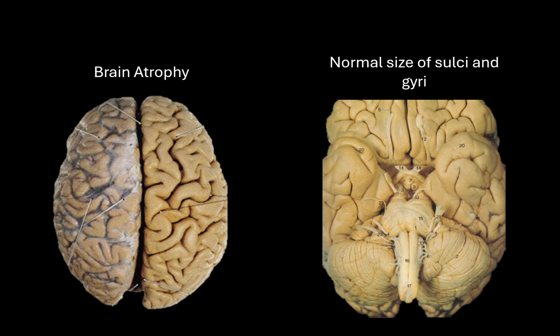Hi, Dr. Ray here. I'm making this video so that you can evaluate your brain and look for any pathology that might be present when you do your autopsy assignment. Here you can see two brains, one from a superior view and the other one from an inferior view.